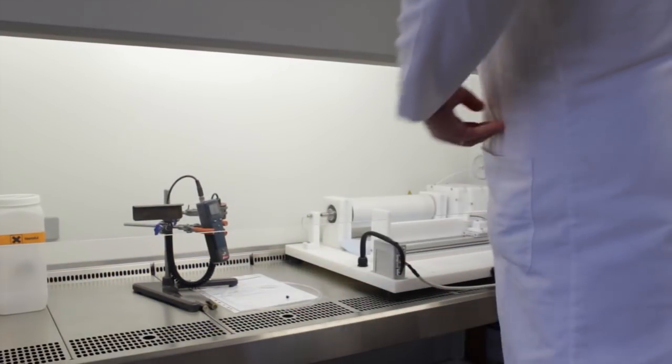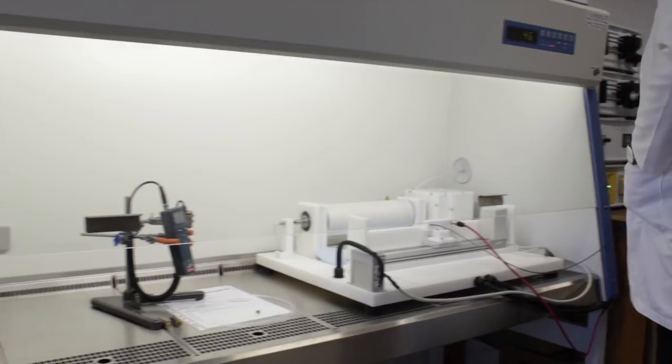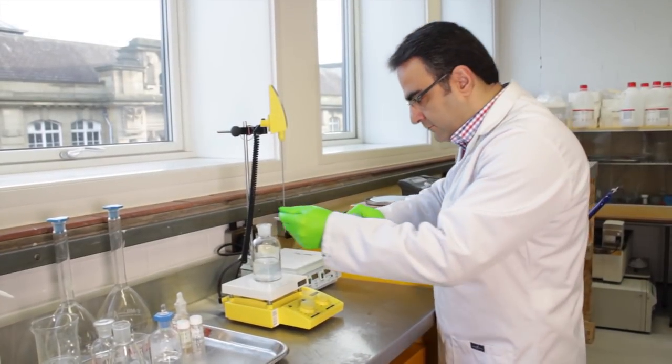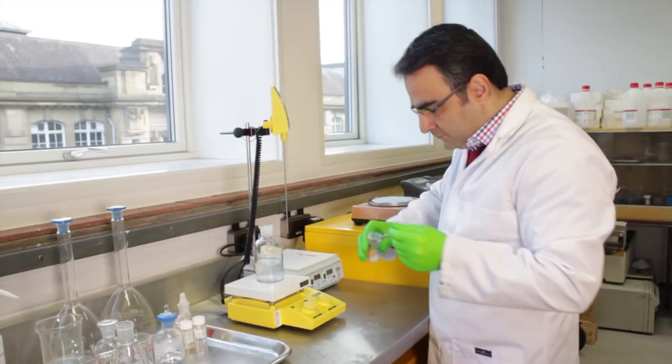Electrospinning is a process which enables us to produce micro and nanofibers. Polymer solution was prepared by adding polymer to suitable solvent.